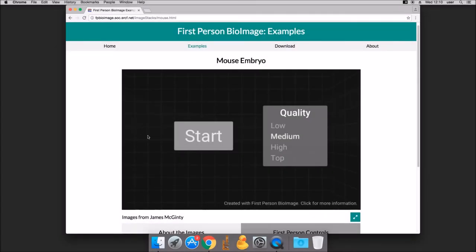Welcome to the FP BioImage User Guide. This video will explain how to use FP BioImage to view 3D data. If you need instructions on how to share your own 3D image data, please see the sharing guide video.